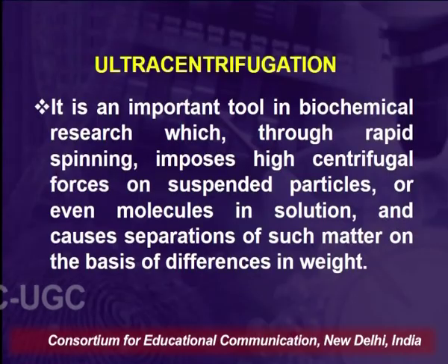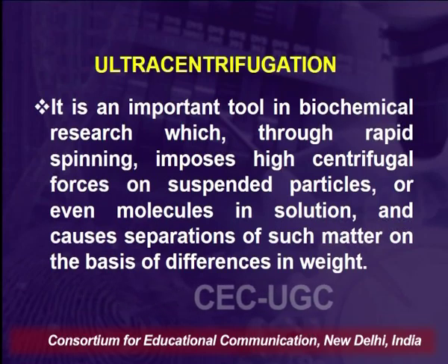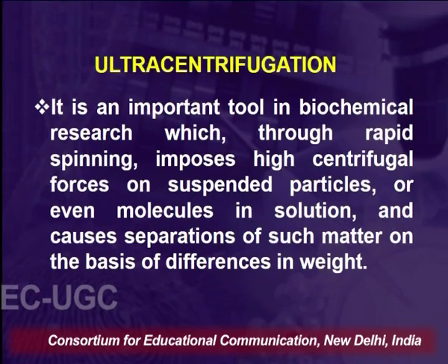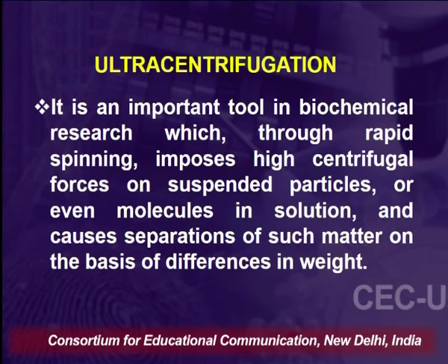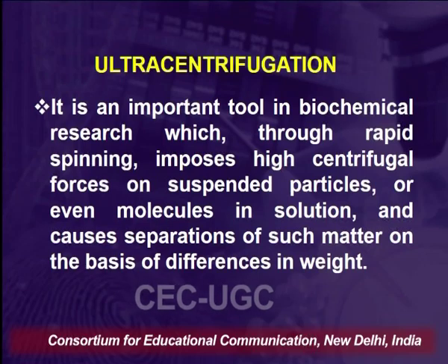This is an important tool in biochemical research, which through rapid spinning imposes high centrifugal forces on the suspended particles or the molecules in the solution, which causes the separation of the matter on the basis of differences in their weight. So, ultracentrifugation works on the principle of differences in weight.